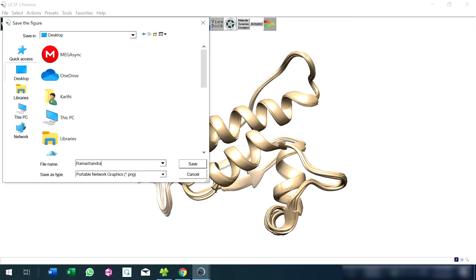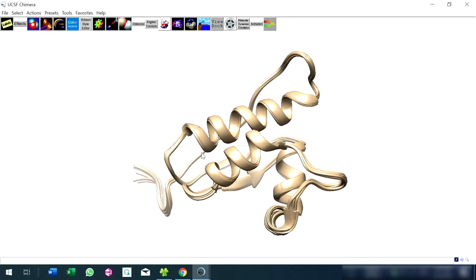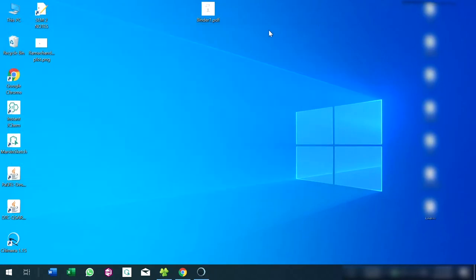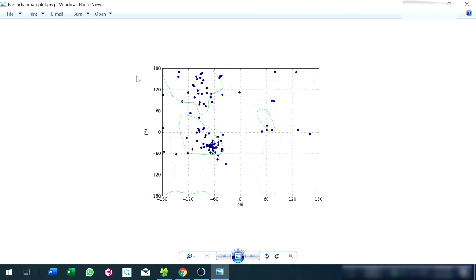Enter the filename for the plot and save. Now this is the output image file.